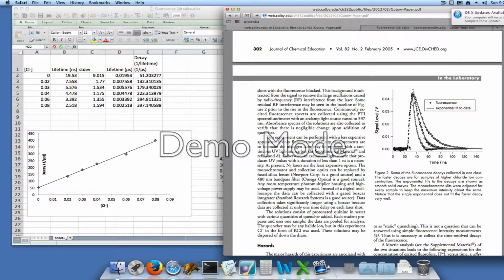And so what happens is, say this is when the photon gets emitted from the light source, and you can see there's about a 20-nanosecond time delay between when the clock starts and when the photons are emitted. And then every point here, the instrument integrates the time, and you can see here it integrated the time over 20 nanoseconds, so it said, okay, we have X number of photons coming back through the detector after 20 nanoseconds, after 40 nanoseconds, after 60 nanoseconds, etc. And as you can see, most photons are coming back through the detector after about 10 nanoseconds.